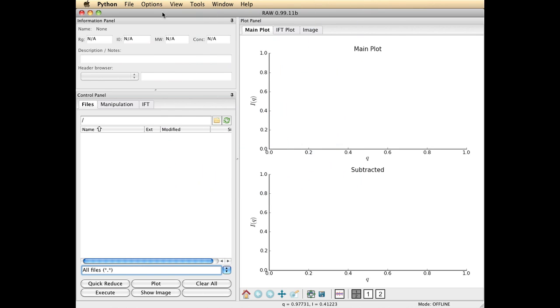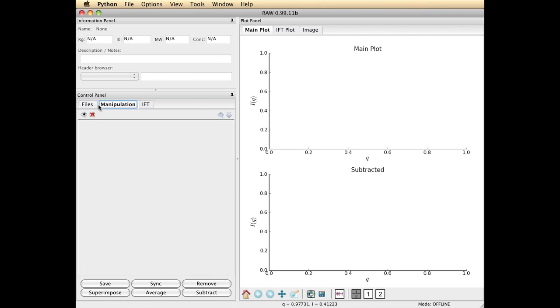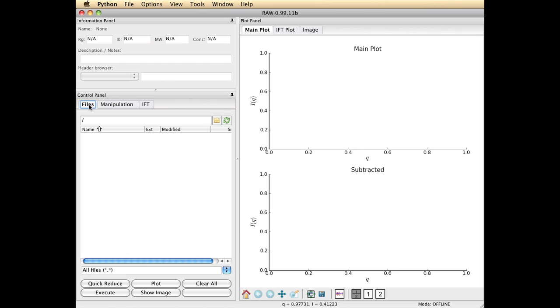When you first load RAW, you'll see a Python toolbar across the top, which I'm going to completely ignore in this demonstration, and you'll see a couple of tabs which are important, the file tab and the manipulation tab.